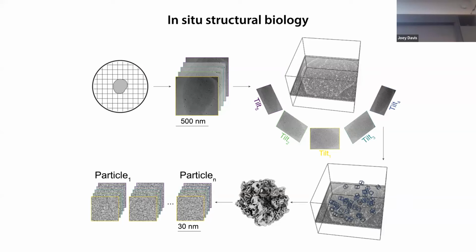Within that tomogram, you can pick individual particles, things like ribosomes, and then historically people would do the same sorts of averaging approaches to mix all those subtomograms together to increase the resolution, and then they'd actually see these structures now mapped to their cellular location. Okay. Same problem that we have with single particle, you're averaging and you're assuming structural homogeneity.